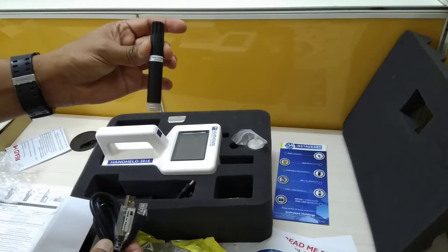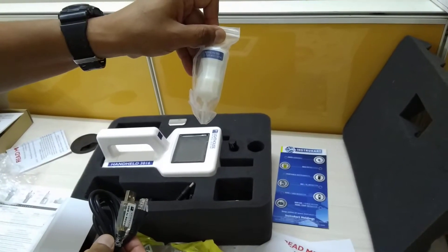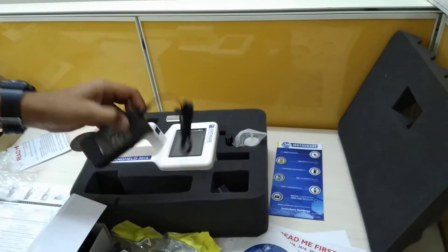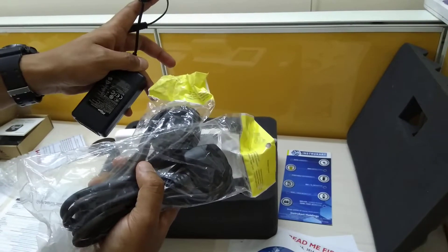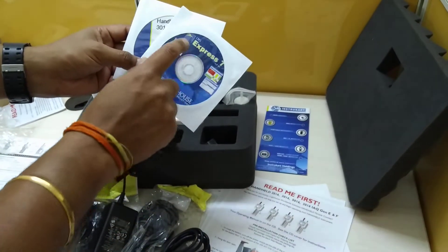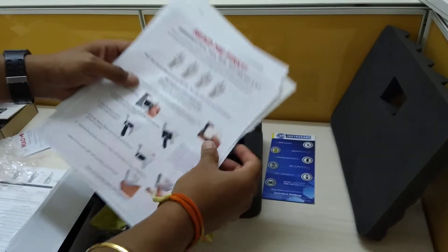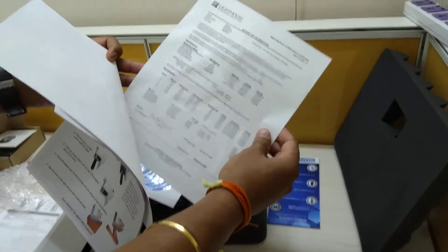Also included are the RH probe, purge filter, washer, and an adapter with two different plug options. On the software side, there is the LMS Express CD and an operational manual with documents including a read-me-first guide, parts list, and calibration report.